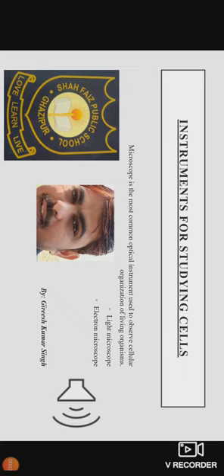Today I am preparing this slide to make you understand the instruments for studying cells. Dear students, cells are microscopic in structure and cannot be seen with a naked eye. So they are studied with the help of instruments, and the instruments are called microscopes. These provide enlarged images of cells and the structures they contain.